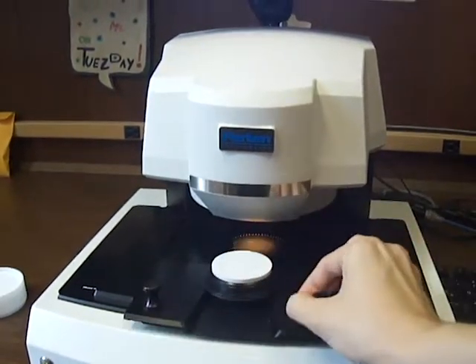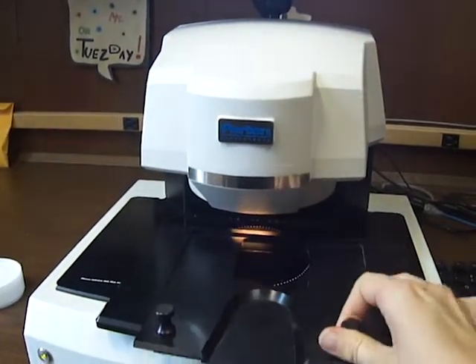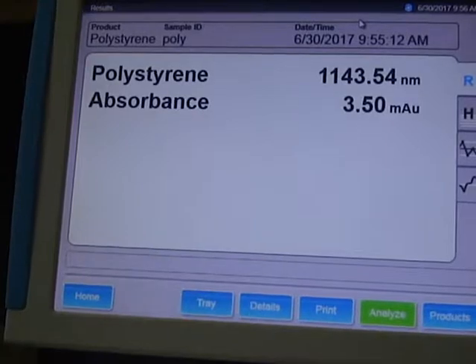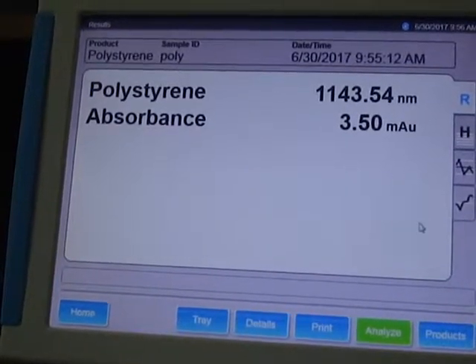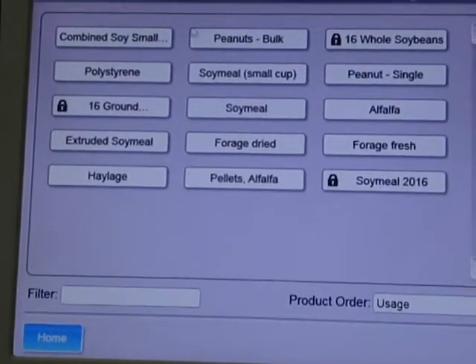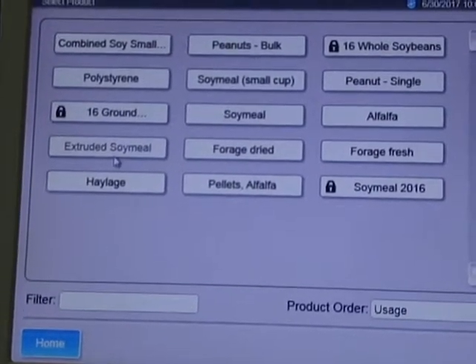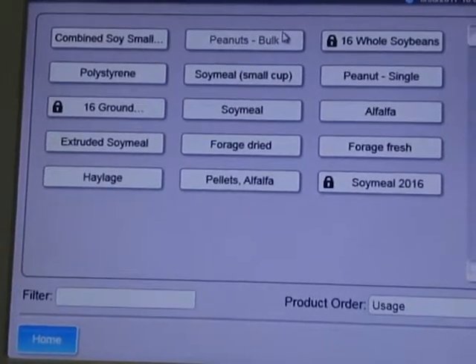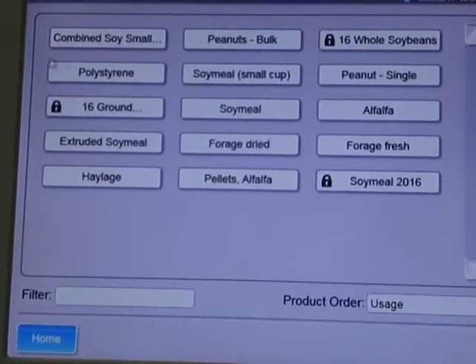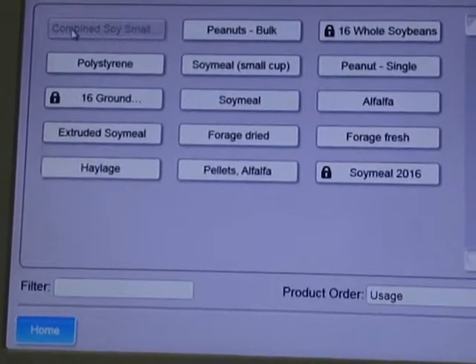Remove the polystyrene block and the magnetic tray from the machine. In the bottom corner of the screen, select products. On the screen are analyses for soybean, polystyrene for calibration, peanuts, forages, and alfalfa. This video will focus on analyses of whole and ground soybean using the combined soy small cup program.